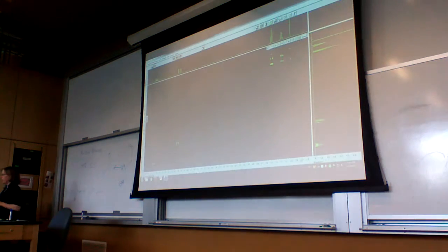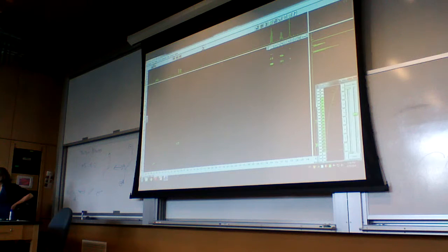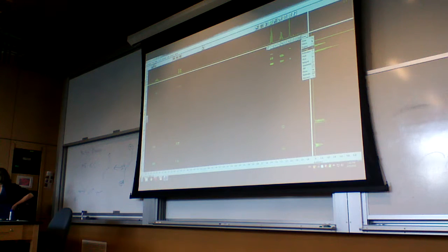And if you're not sure how to do that, the JEOL website has a tutorial on that. And if you're not in the lab, I can send you that link. You may also need to look at the level tool. So I'm going to add a little bit more signal here so we can look at it. And the level tool. And then the cursor is the one I was going for.